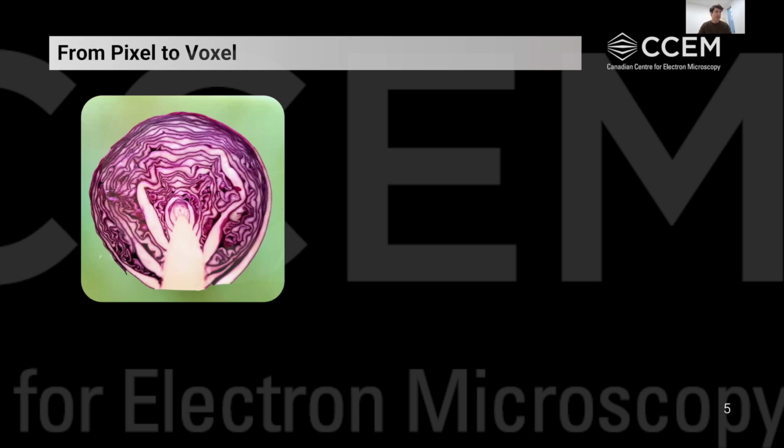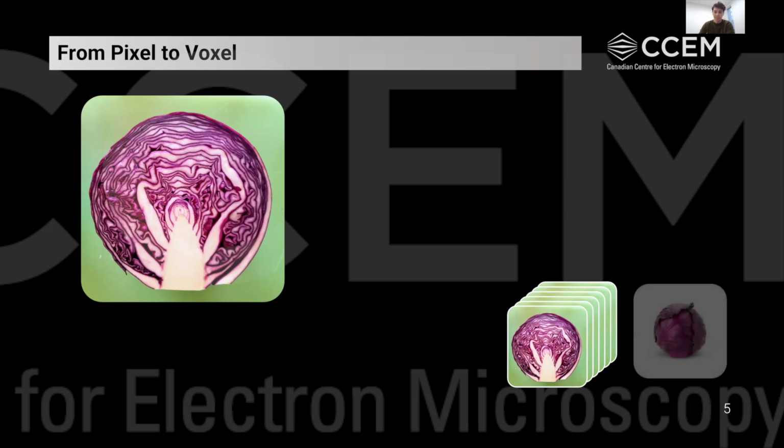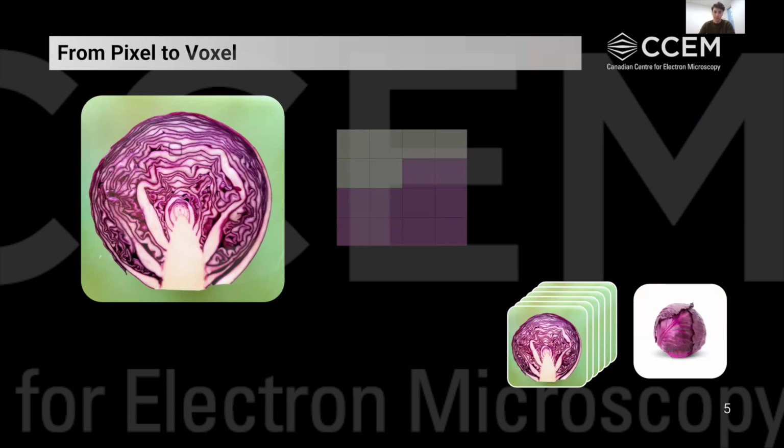Now, if we look at one slice of this cabbage, for instance, one image, we have its representation in space, depending on where that slice was taken. So if we take our series of images from these cabbages, we align them in such a way that they are in order in the slice number that they were sampled from. We can actually build a digital reconstruction of our cabbage, even though it has been milled away. It's been destroyed completely by this FIB-SEM tomography process.